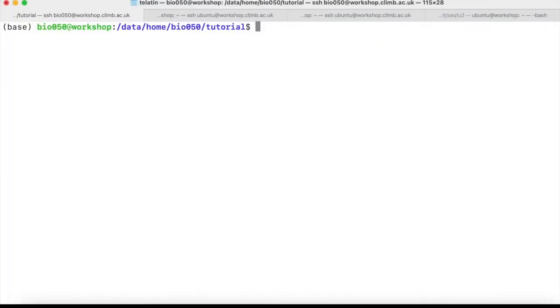Now we are ready to import our FASTQ files into a QIIME2 artifact so that it can be used for QIIME2 analysis. So let's recap.